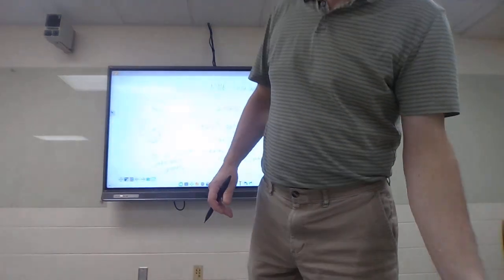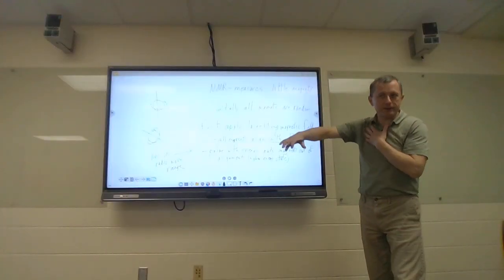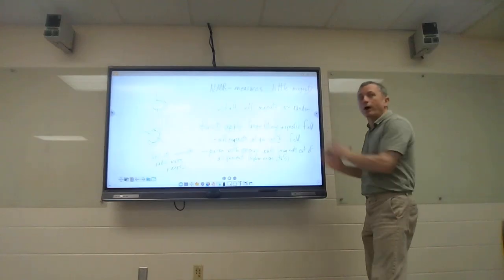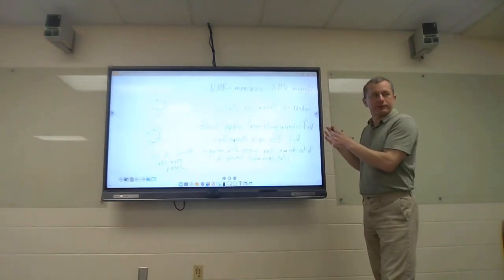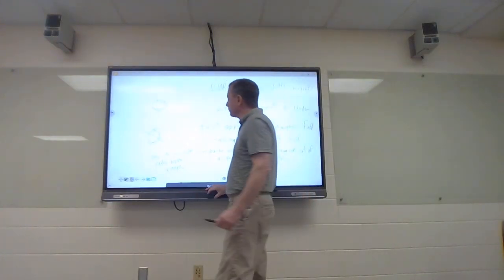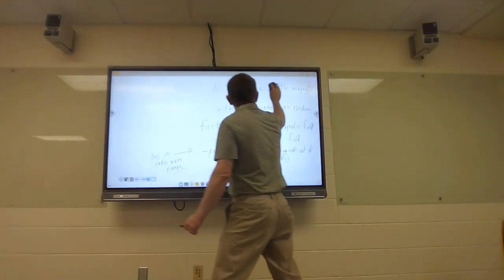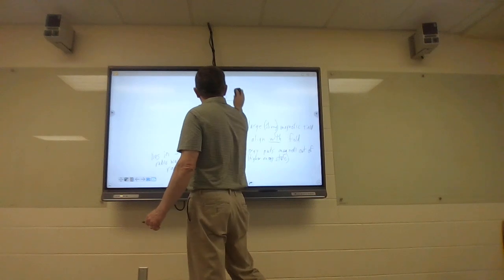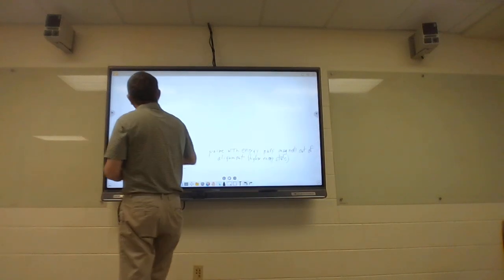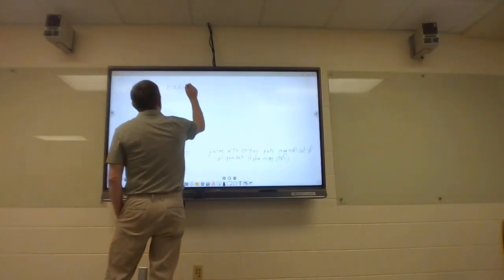So, going through this basic idea that we have an excited state and a ground state, once we have it in that large external field, that difference in energy state lands in the radio wave frequency. Some things make our radio wave frequency different. Shielding. I'll get there eventually.